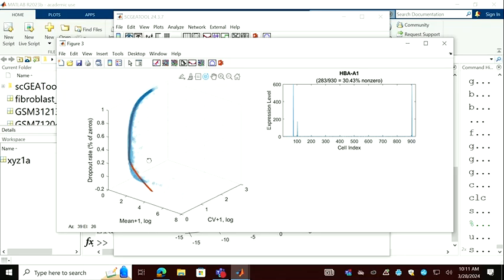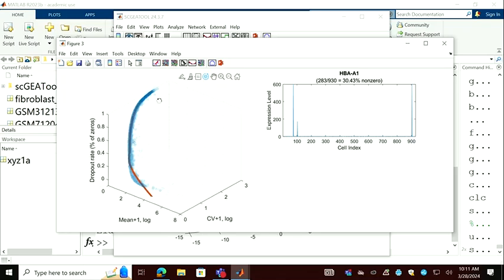Yeah, we can start to see some of the genes jump out, but not many. Oh, the first one that pops out is a red blood cell? Oh, red blood cell, yes. It's kind of a contamination, okay? Yeah, this is hemoglobin.